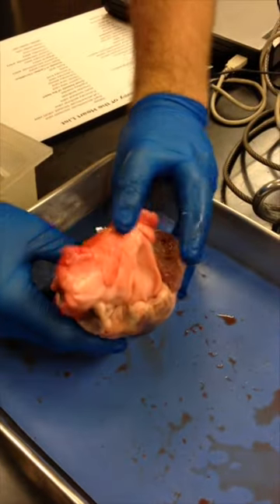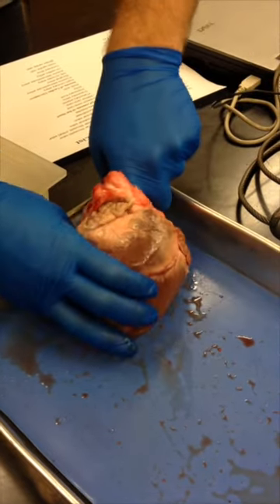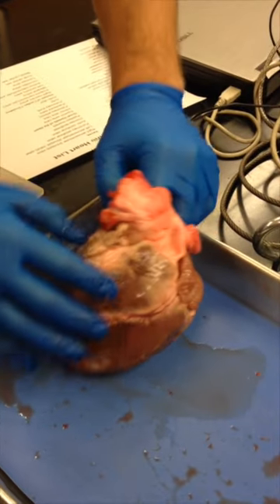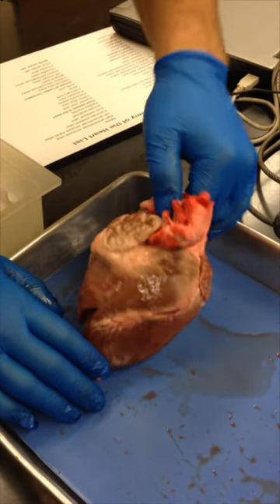And yeah, you're right. And this is the aorta, right? I don't know, is it? But it goes in the left side, so okay. I'm pretty sure it's aorta. We're having a hard time finding the vena cava. Is that where it enters the atrium? Is it the superior and inferior vena cava? The vena cava enters the right atrium.